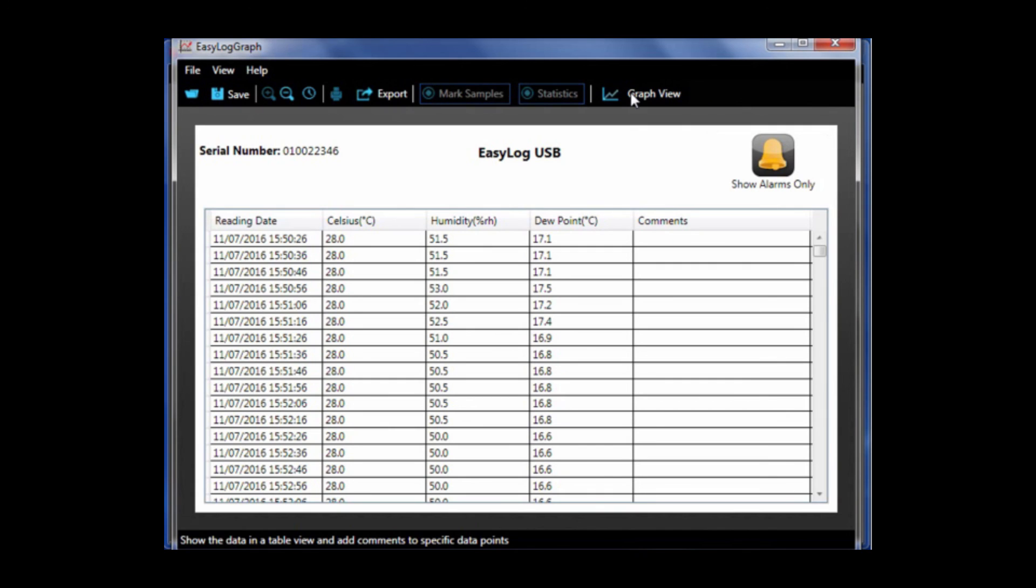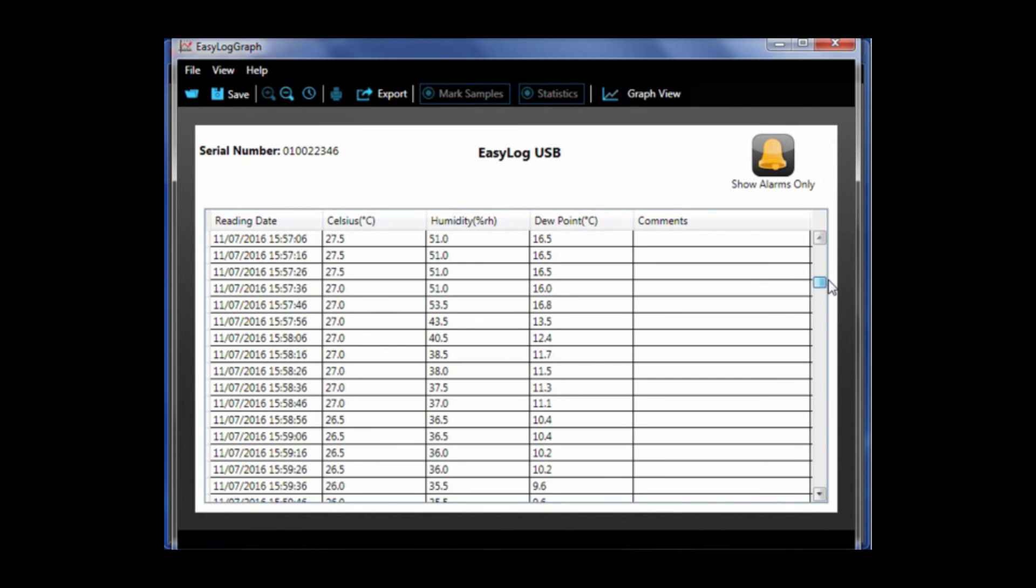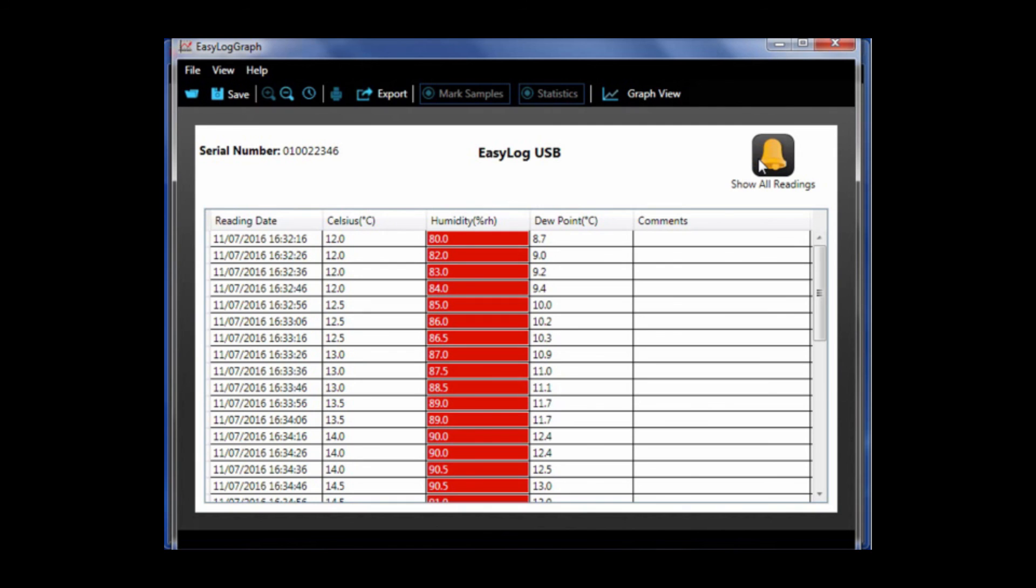The data view button allows you to view data in a table and add comments to specific data points. Also if you click here it will show you all of the alarms.